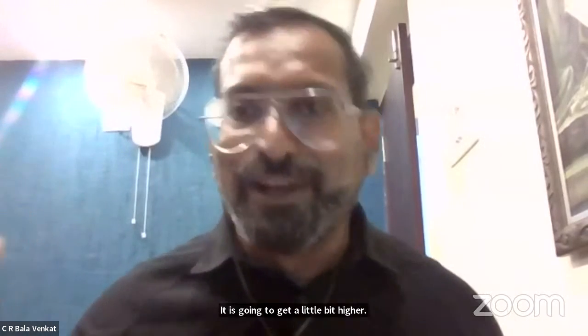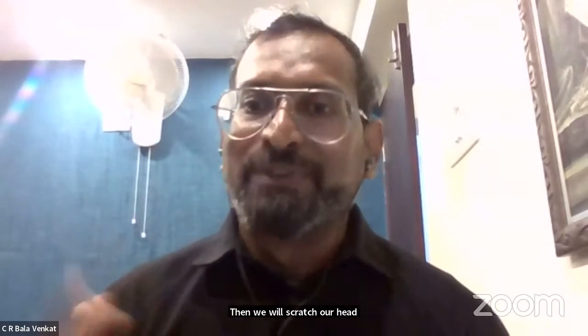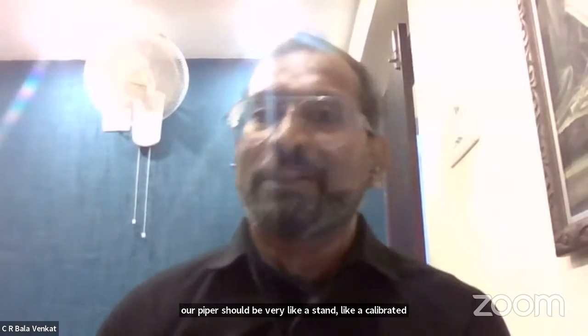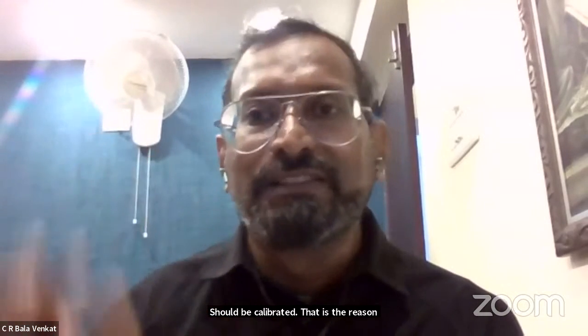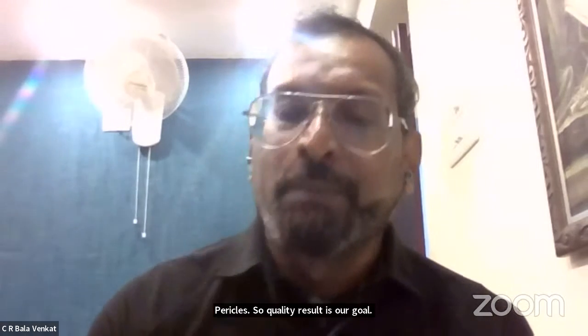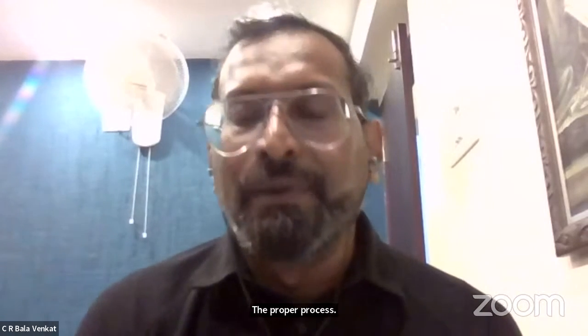Then we will scratch our head wondering where things are going wrong, when it's a new vial. So our pipette should be calibrated ones. Every tool and equipment we use should be calibrated. That is the reason this gives quality results. So quality result is our goal. So we have to maintain the proper process and standards for the lab and the technicians or staff.